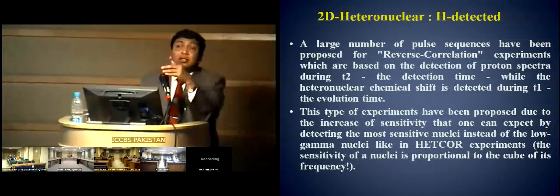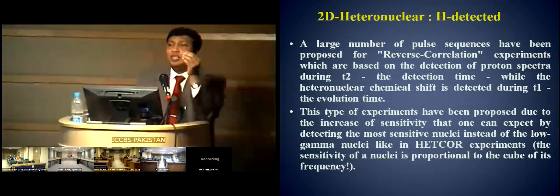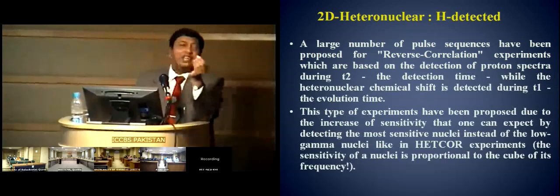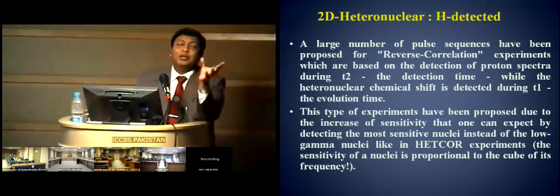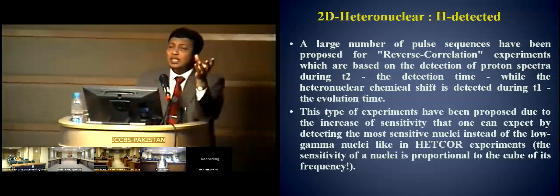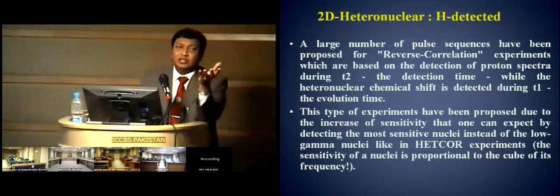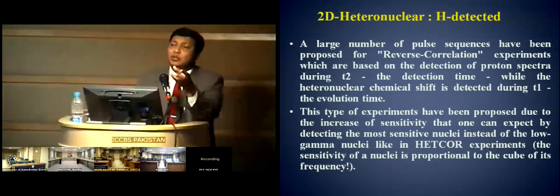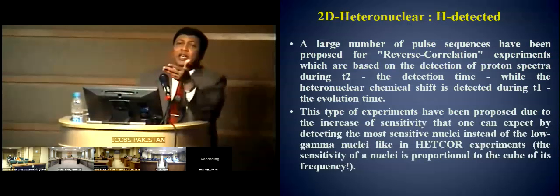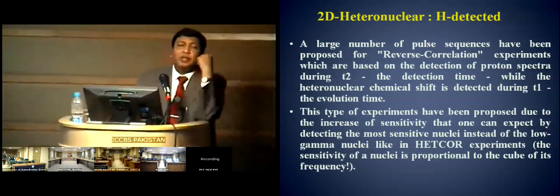Information which you got, you're not detecting proton. Kindly remember, you're detecting only the carbon. But even then you learned something extremely interesting about attached proton, and that was that the quaternary carbon has no proton. You also learned by using attached proton test that the carbon which has 3 protons moves faster, and the carbon which has 1 proton moves slower, because they have a spin relaxation time which is less than the spin relaxation time of a methyl.